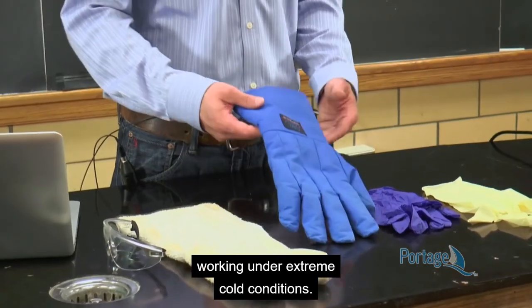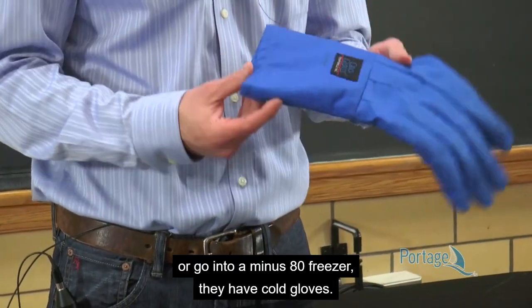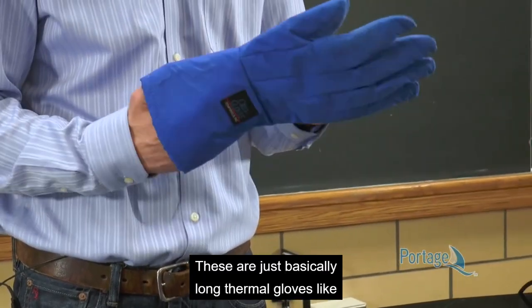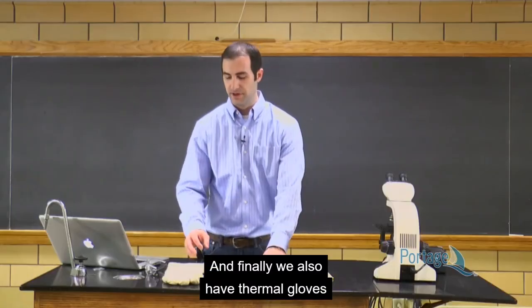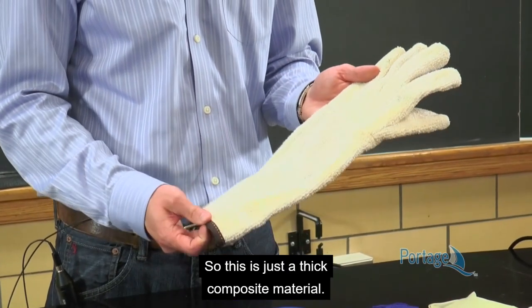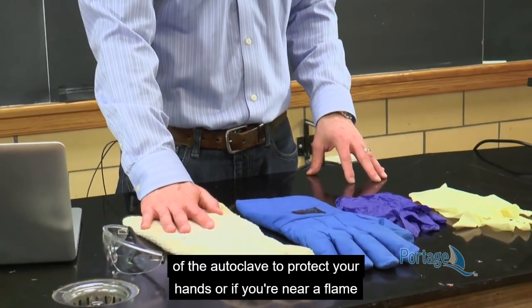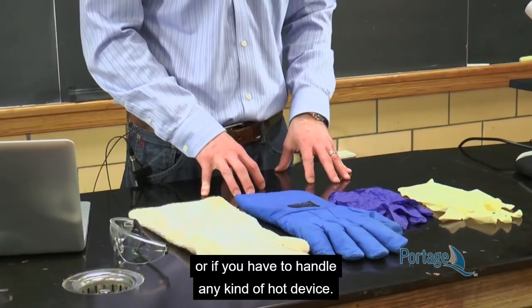First, if for any reason you're working under extreme cold conditions, if you're working with liquid nitrogen or going to a minus 80 freezer, they have cold gloves. These are just basically long thermal gloves that you would wear in the winter. And finally, we also have thermal gloves for the other end of the spectrum for heat. This is just a thick composite material. This will be used for pulling things out of the autoclave to protect your hands, or if you're near a flame or if you have to handle any kind of hot device.